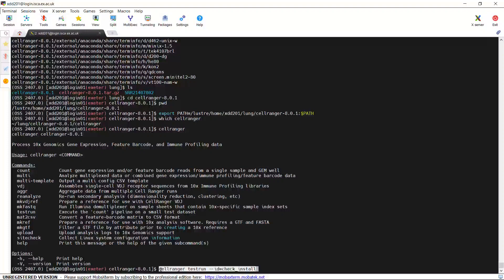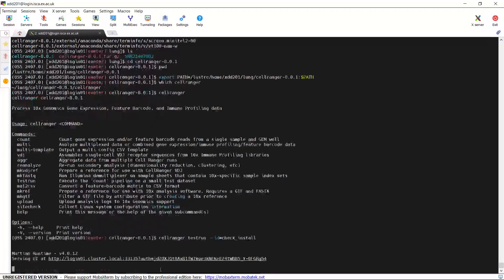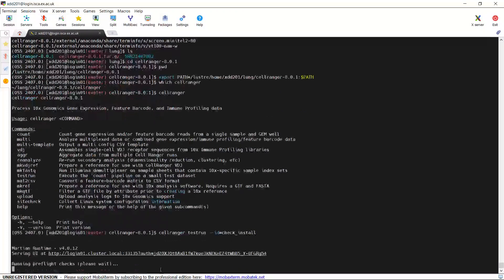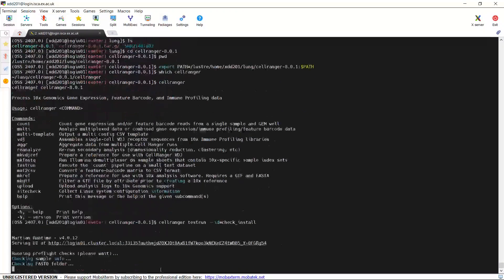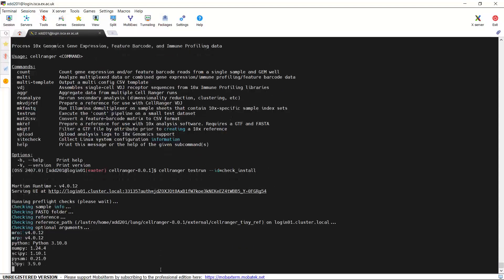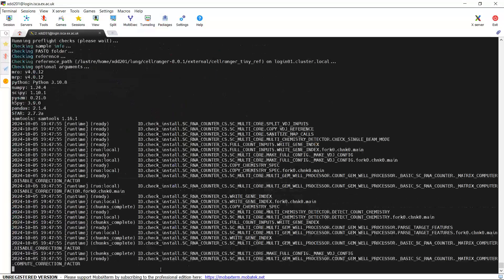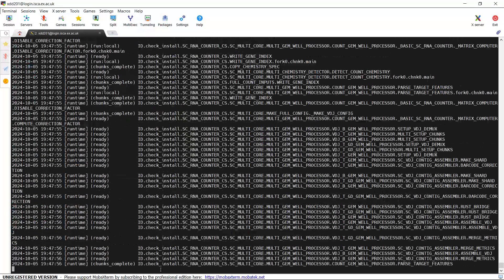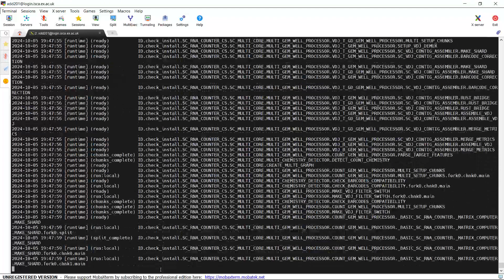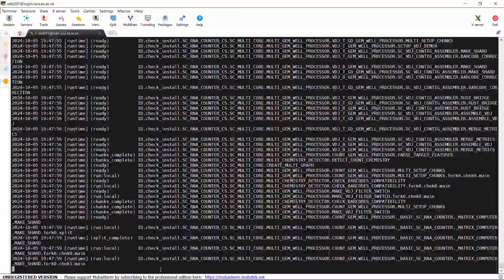We can use the testrun command to check if we can run CellRanger software in my account. Let's run the testrun function. You can see it is running and it will take about 3 minutes to complete the test run.